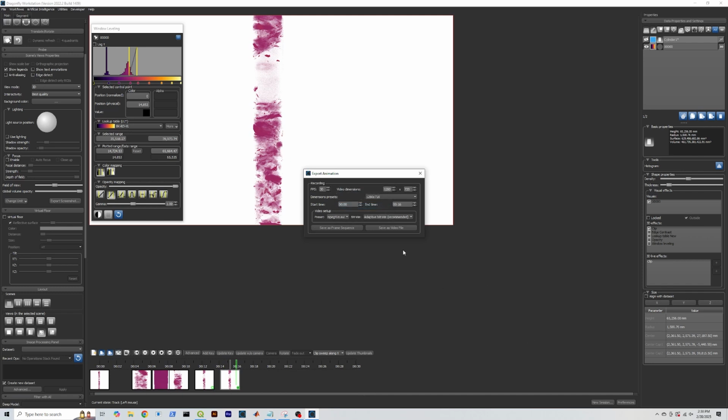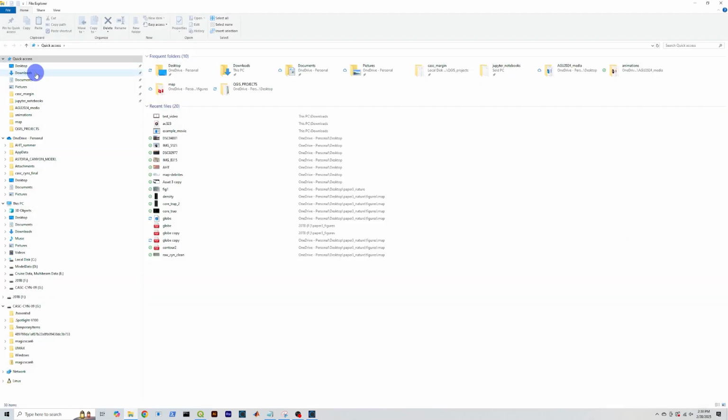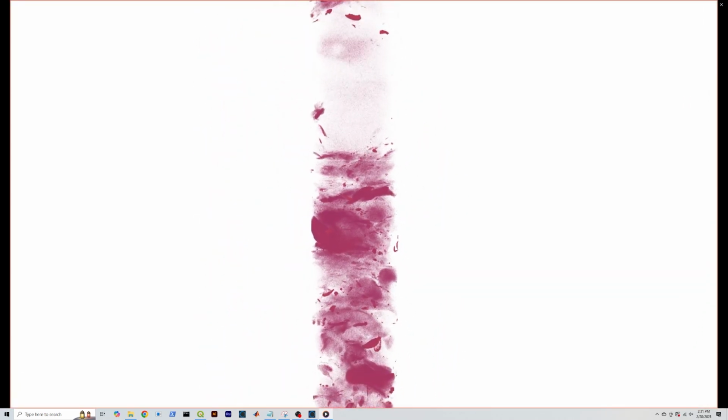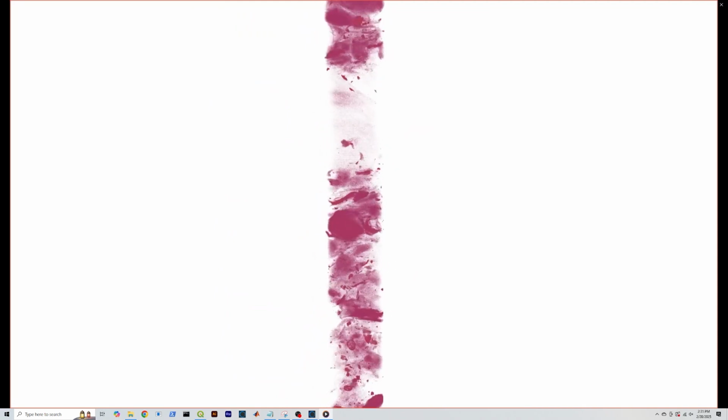All right, cool. So we just exported, and we will go to our downloads now. Look at our downloads, test video, and we can watch it. We can play it back. And so we might say like, oh, I think we should up the resolution, and so on. And you can iterate pretty quickly on the appropriate video that you need. And you can go longer than 30 seconds if you want to. That is not a problem.